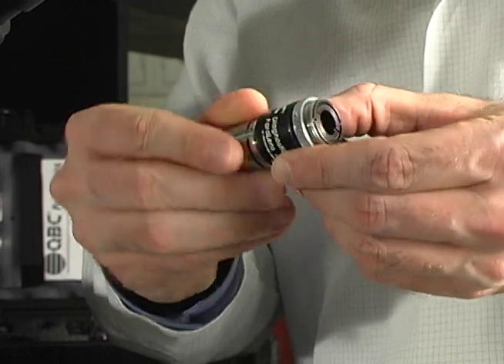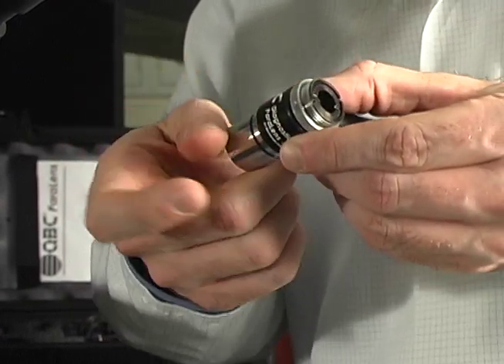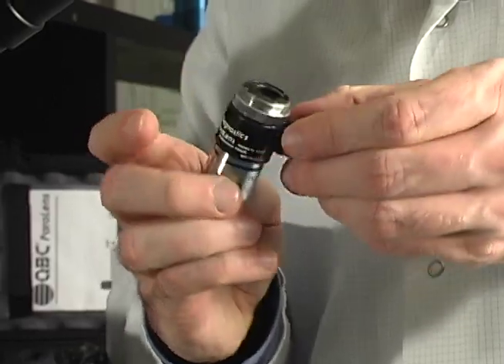Next, let's attach the Paralens and its components. To begin, attach the desired objective lens to the body assembly, screwing it tightly onto the attachment.